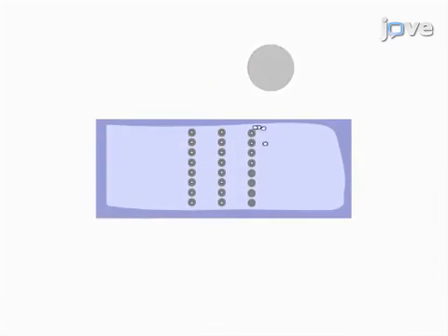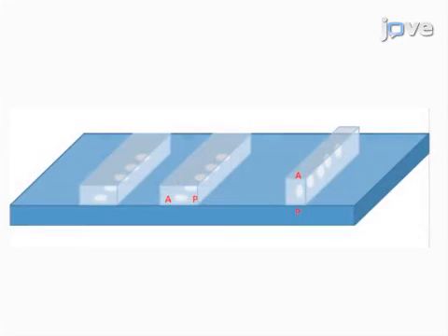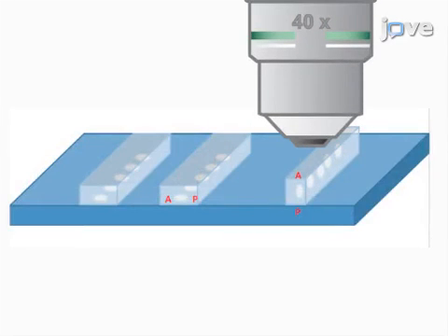Next, selected samples are oriented and aligned, then embedded in glycerin jelly blocks. The final step is to cut and rotate blocks to mount egg chambers so the long axis is vertical.